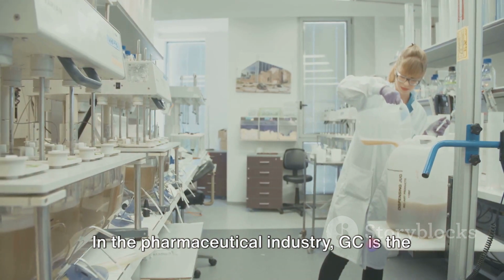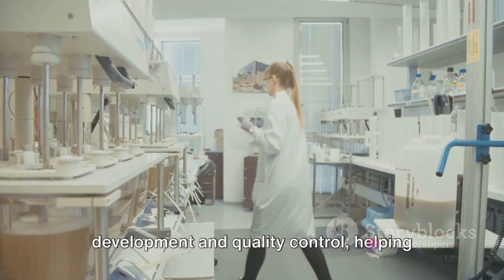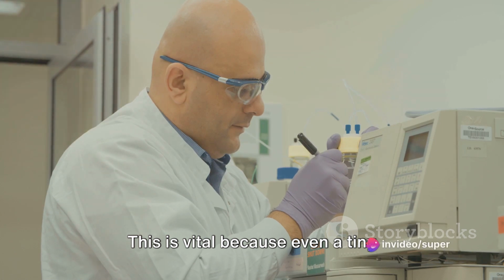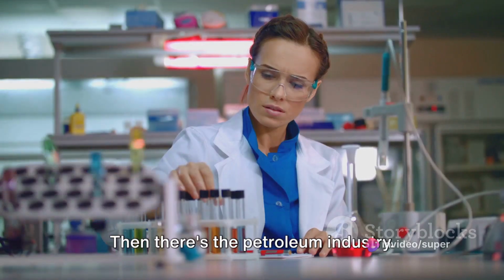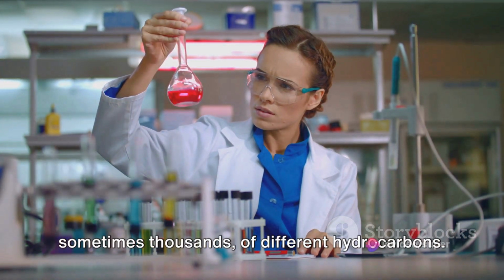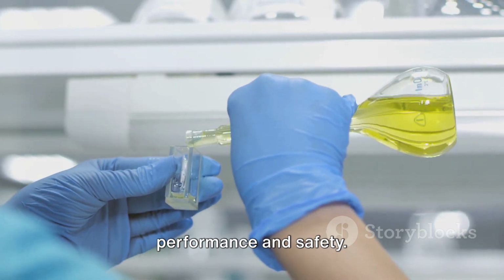In the pharmaceutical industry, GC is the unsung hero that ensures the purity and potency of medicines. It plays a crucial role in drug development and quality control, helping scientists identify any impurities that might sneak into the medication during its production. This is vital because even a tiny impurity can have serious implications for patient safety. Then there's the petroleum industry. From gasoline to lubricants, petroleum products are complex mixtures of hundreds, sometimes thousands of different hydrocarbons. GC is employed to refine and analyze these mixtures, ensuring optimal performance and safety.